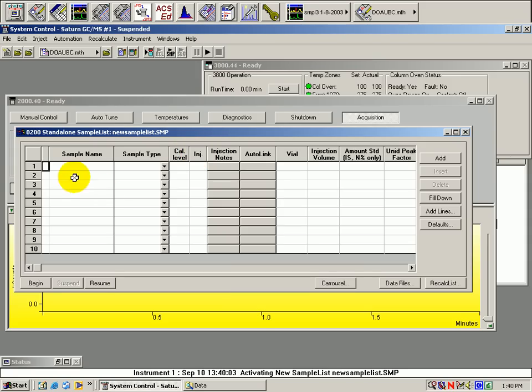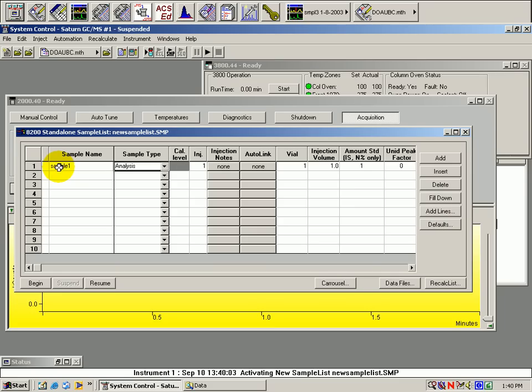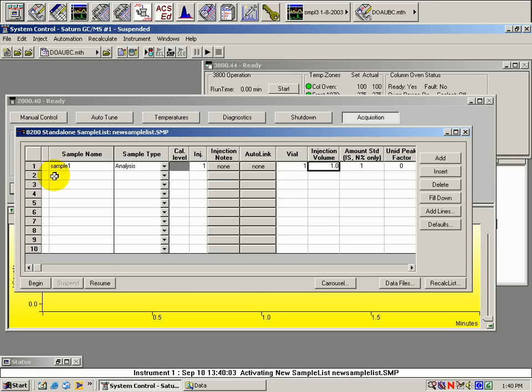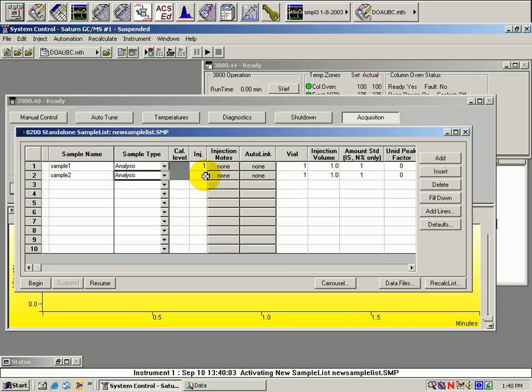Now, begin by filling in the information needed on the actual injection list. The sample name, in the next column the type of operation, the number of injections, the vial and where it is located, and the volume of the injection. The same for sample 2 and multiple samples afterwards.